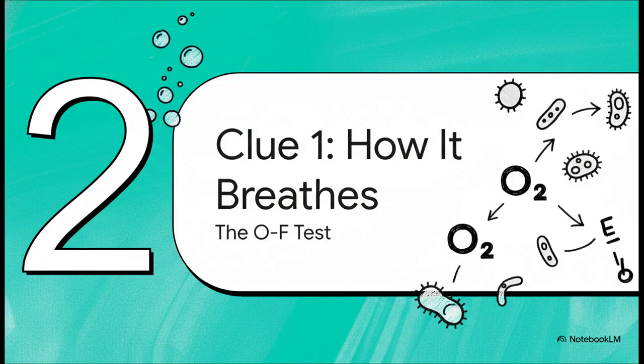Okay, our first line of questioning. It's pretty simple, but it is absolutely fundamental. We just need to know, does our little suspect need oxygen to break down its food, or can it get the job done without it? This is where the oxidation fermentation test, or just OF test for short, comes in.